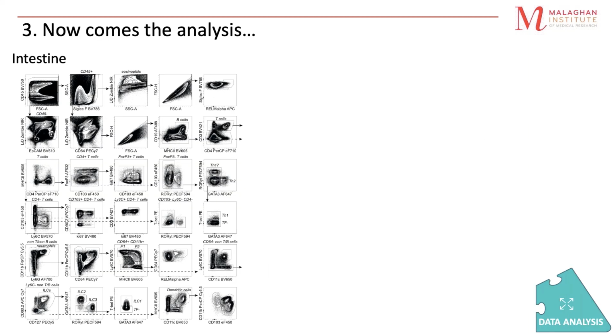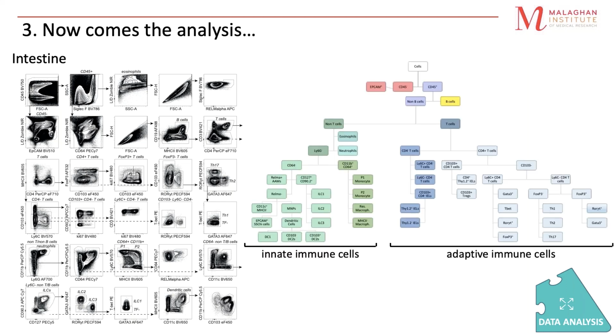After taking into account all these tricks and following all the steps that Kate has been talking about, we wanted to make sure that our gating strategy was also looking good and that we could clearly define and separate all the cell types that we were interested in. At this point, we found that our gating strategy was looking very good, and that we were able to gate and quantify at least 44 populations of the innate and adaptive immune response.